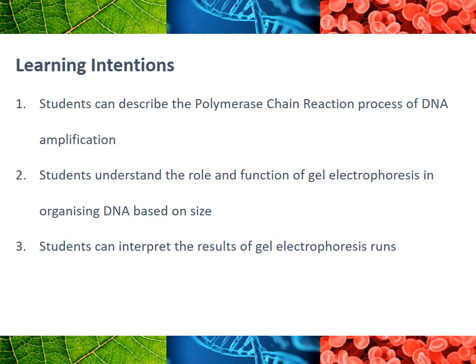We're going to look at this particular process called the polymerase chain reaction, and then also a different process called gel electrophoresis. Now I know there's a few new big terms in here, so it's really important, especially because we're not in class and I'm not asking you questions and getting you to practice saying these words, that you do that a little bit. It might sound a bit silly, but practice talking these things, explain it to someone else, or even just say it out loud to yourself so those words stick in your mind.